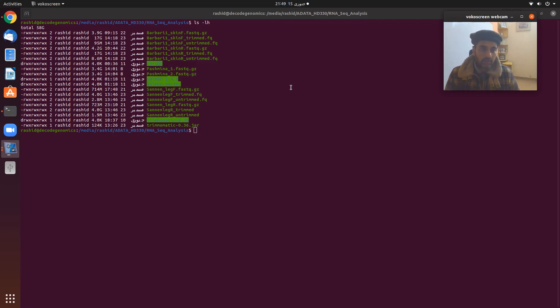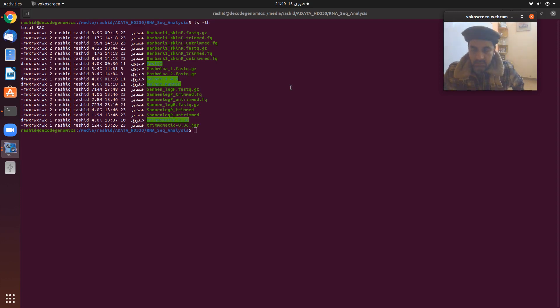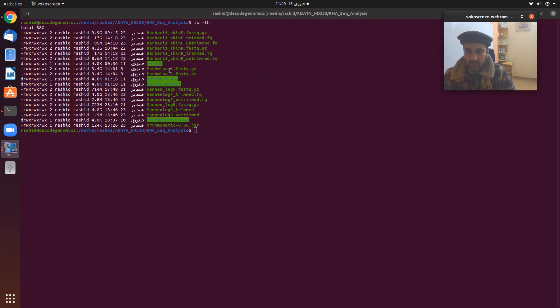Bismillahirrahmanirrahim. Dear listeners, we are now going to perform step number two of our RNA-seq differential expression pipeline. This step is called quality checks. In the previous step we performed the trimming of our Pashmina goat sample one and sample two FASTQ files.